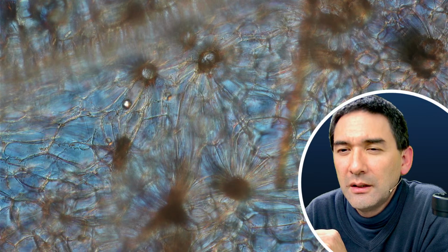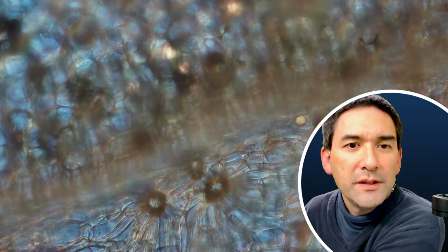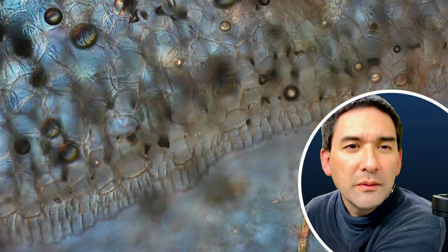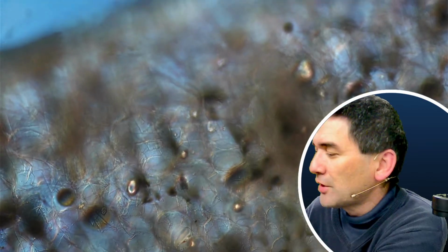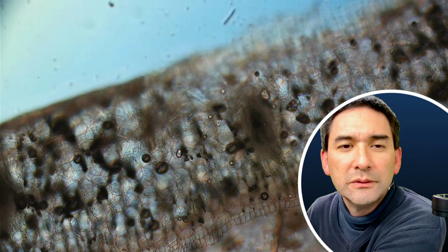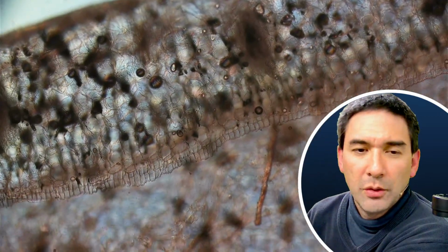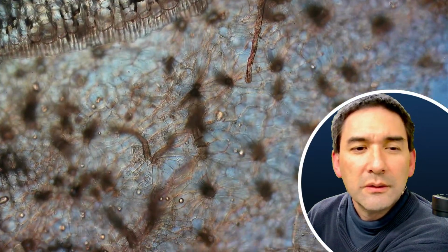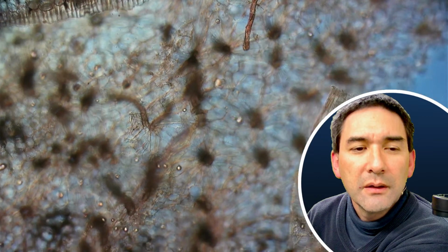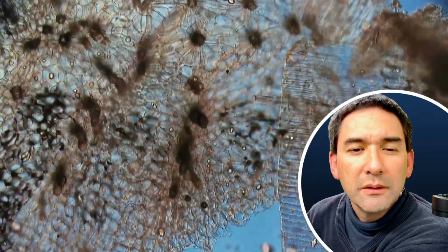I think if you scroll up, we can see the xylem. I don't know if this is the, yeah. But in any case, we can see the individual cell layers. But maybe if I go down with the magnification a little bit, then we get a better overview. Then we can get a better overview here. What's this long thingy here? I don't know.